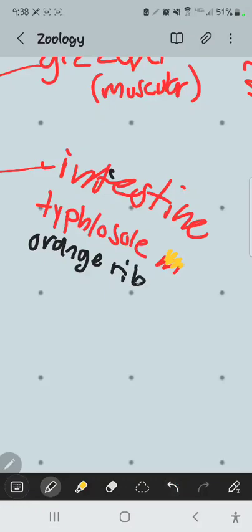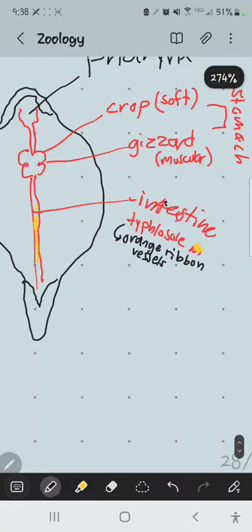Okay, so that's basically the digestive organs that you have to know. The esophagus, like I said, is covered up by a wide variety of things. When you first open the worm, it's covered with mostly seminal vesicles and seminal receptacles. There's a whole bunch of these big pillowy looking things on top of the esophagus. I'm not going to ask you any of the sex parts of these worms, but basically the big pillows on top are sperm storage organs and sperm transfer organs.